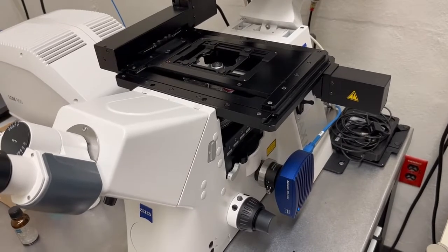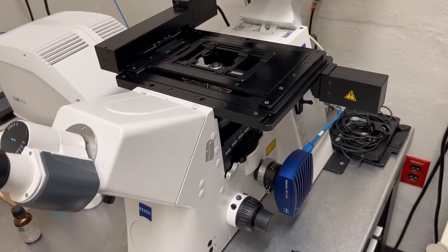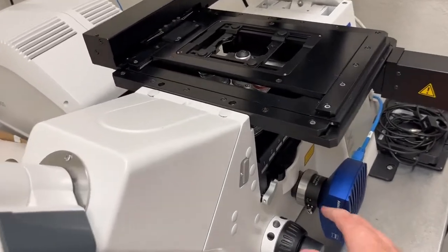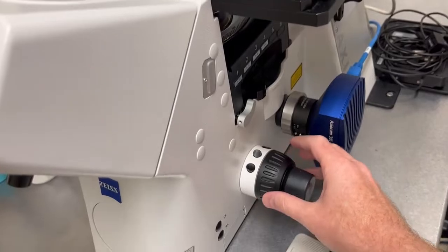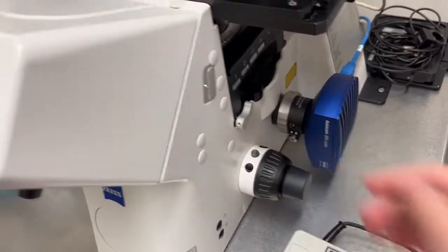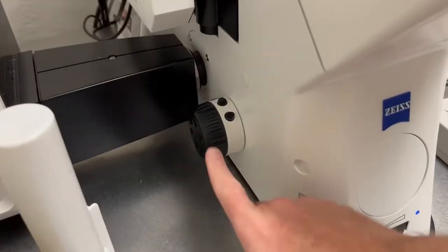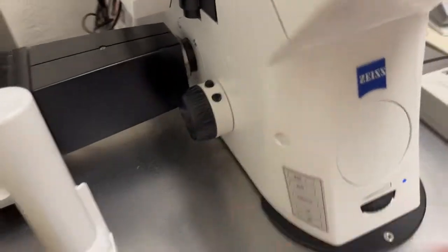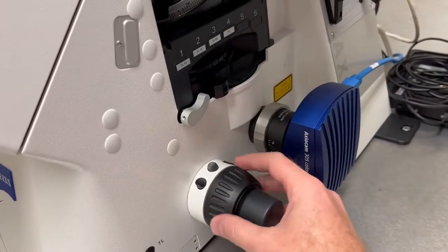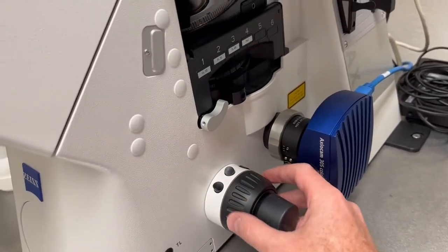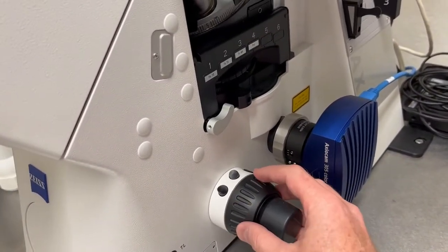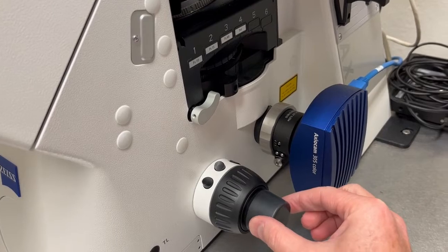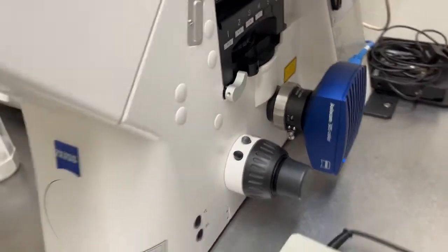To move the objective up and down so that you can focus on this microscope, there is a focus knob both on the right and the left of the microscope. In each case, the bigger outside knob is a coarse focus and the inner knob is a fine focus.